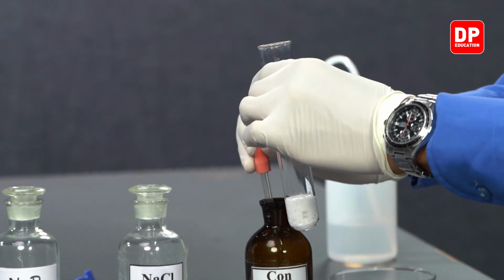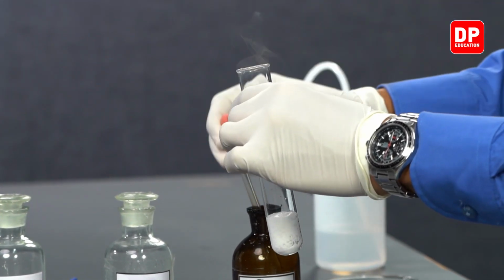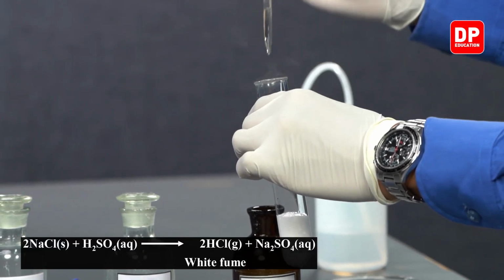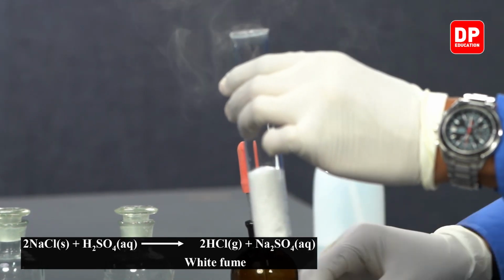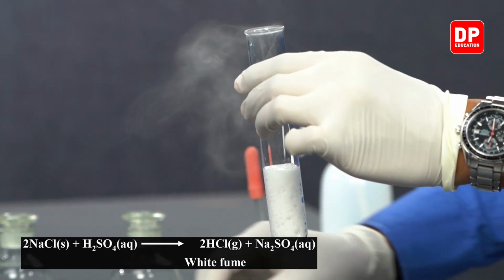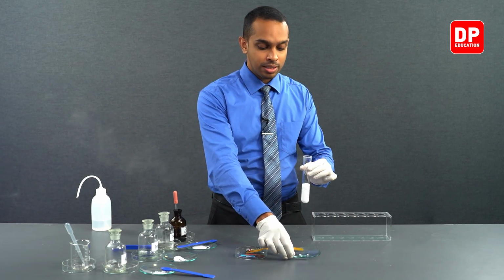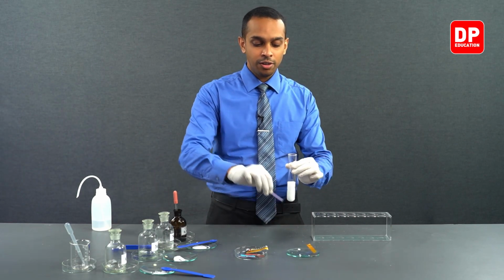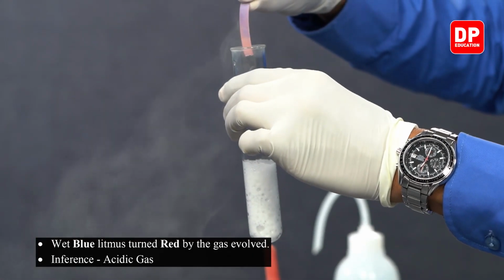This gas is going to be a white color gas, or we call it a misty fume. You wouldn't necessarily have a characteristic color to it, so you cannot identify chloride ions by just adding sulfuric acid. But we can identify the gas that is evolving with the help of litmus paper.